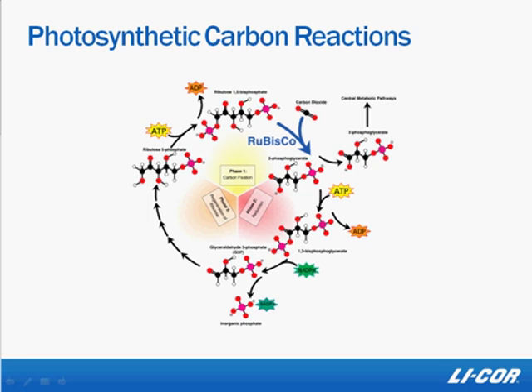Three main biochemical parameters are obtained from a CO2 response curve, although there are several more, but most of the time people look at these three. They look at Vcmax, which is the maximum velocity of carboxylation of rubisco. That's the first step in our pathway on the right. And they look at Jmax, which is electron transport for RuBP regeneration, which is our last step.